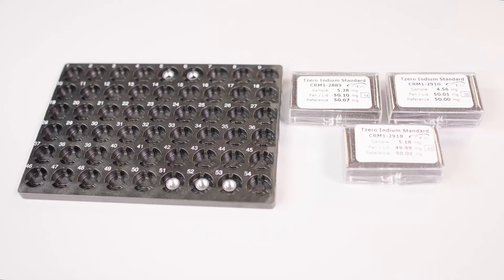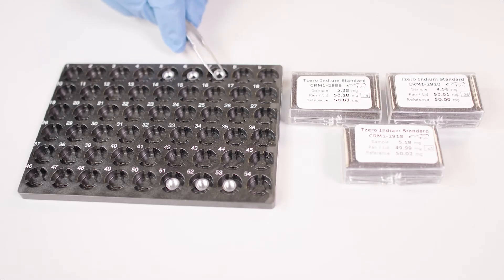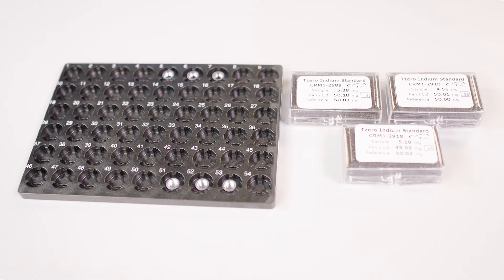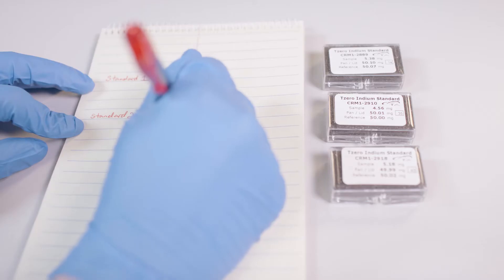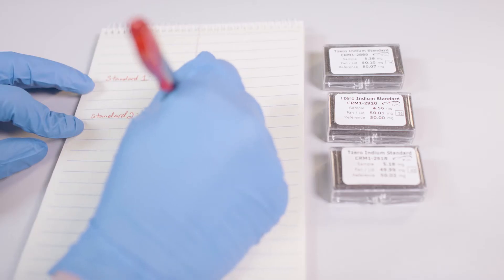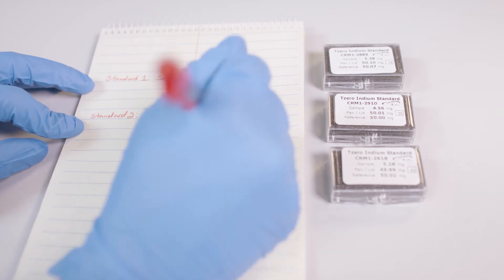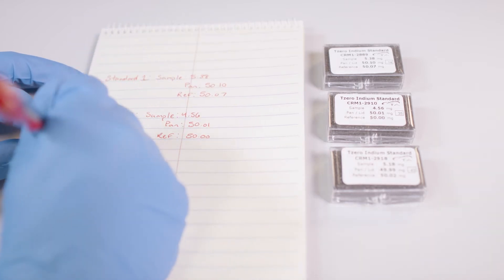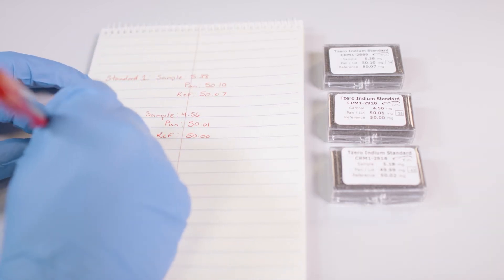To start, we will need to prepare three cell constant calibration standards and place them in the auto sampler tray. Please take note of the sample and pan masses and tray locations where they are placed.